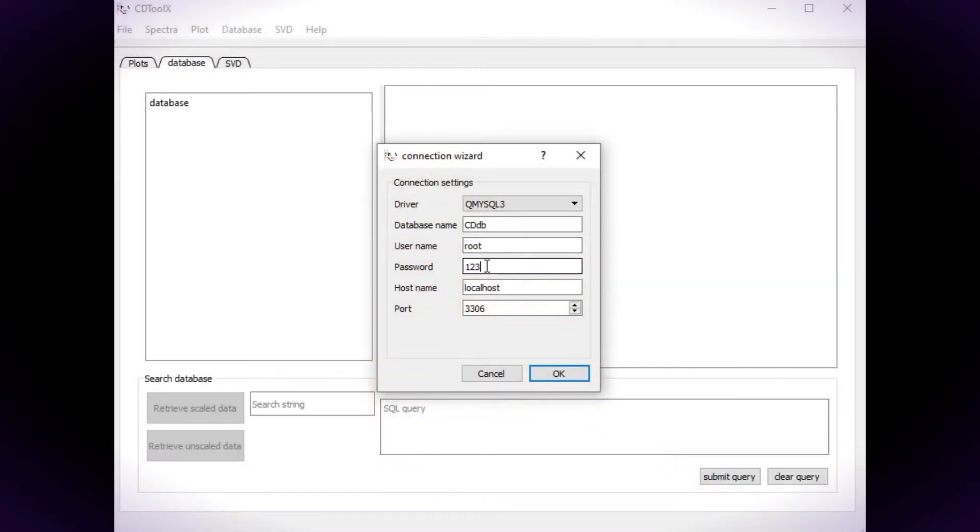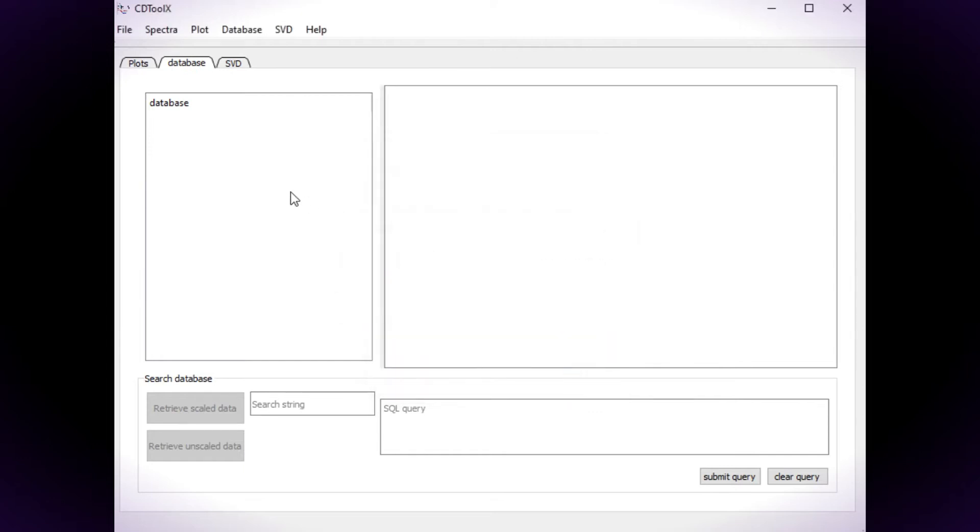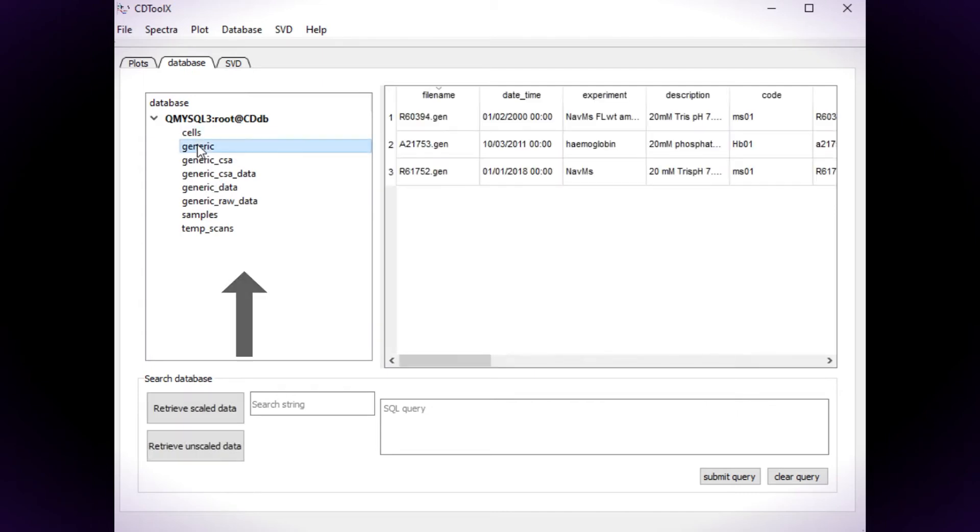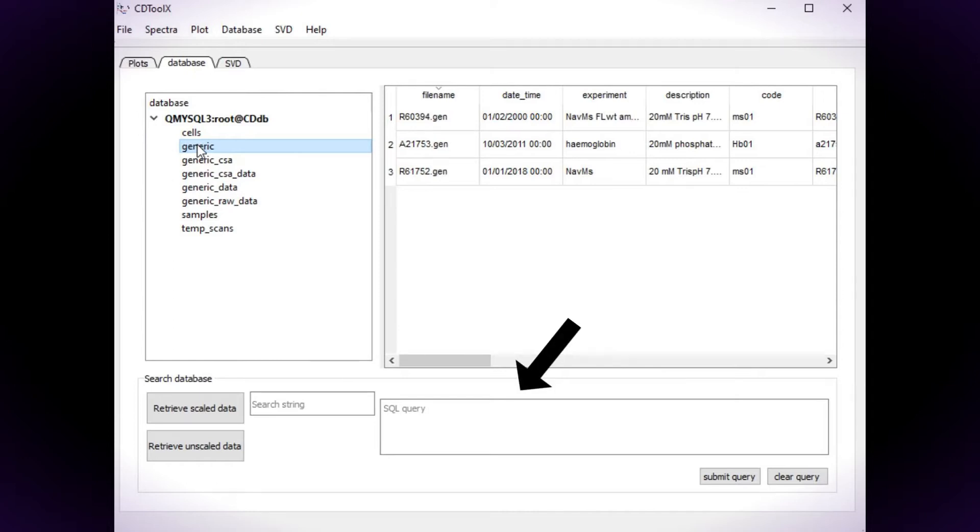Open CD ToolX and connect to the database. The tables are listed in the left-hand window and the table contents are shown on the right. Below this is a single word or character search box, a MySQL command line editor, and the data retrieval buttons.